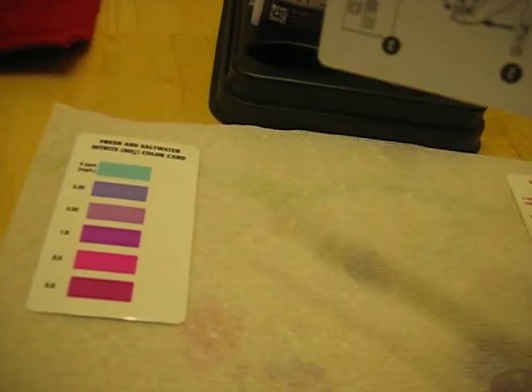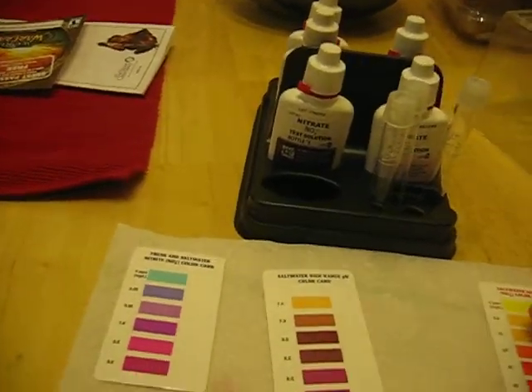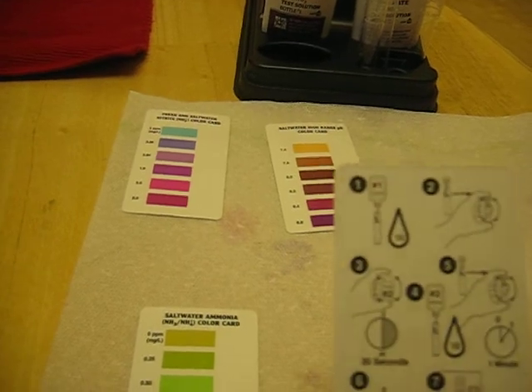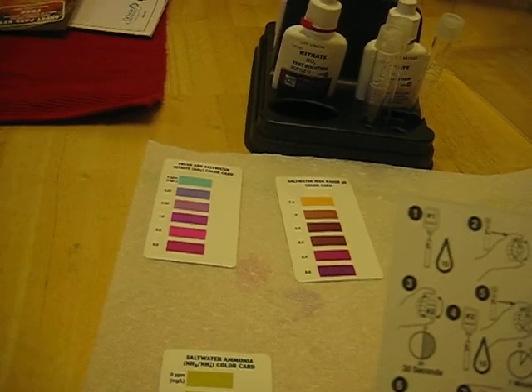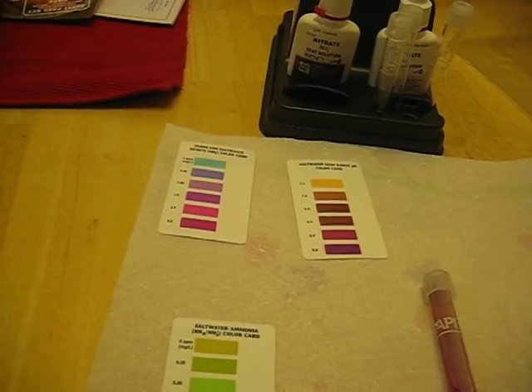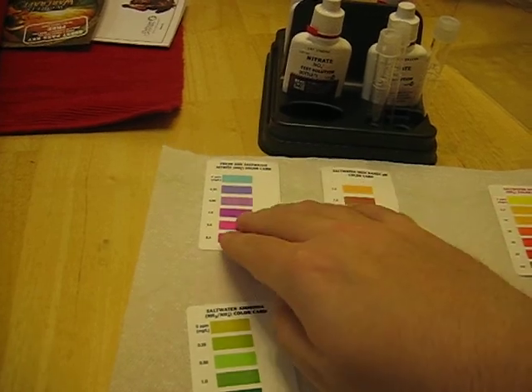The rest of the tests are pretty much just as easy. The hardest one is the nitrate, where you put ten drops of bottle one, invert it a bunch, wait 30 seconds, then ten drops of bottle two, shake it vigorously for a minute, and then wait five minutes. So all in all, if you're doing all of them, I suggest doing the nitrate one first, followed by the nitrite, and then the other two in whatever succession you want, simply because you don't have to wait for the other two.